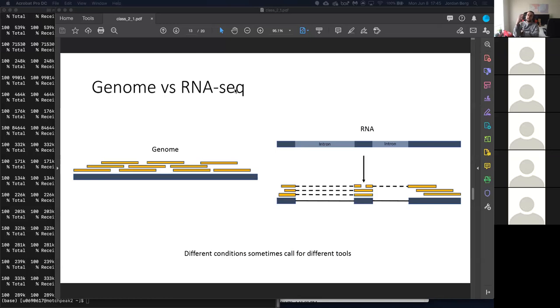preparation. So at face value, for the raw files, you're going to get FASTQ files for both of those. They're going to look identical, but in certain downstream steps, because of the biology and how the actual reads that you're getting off the sequencer were created biologically, that will influence the tools that you need.